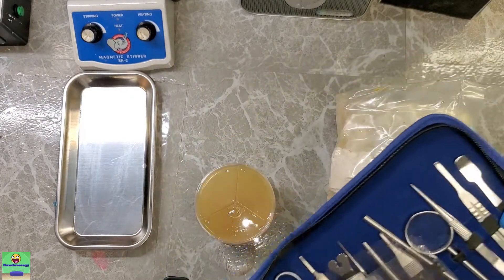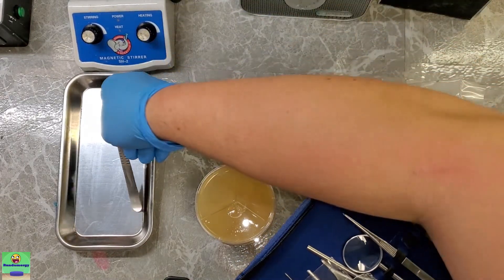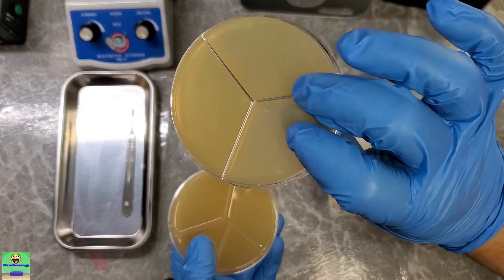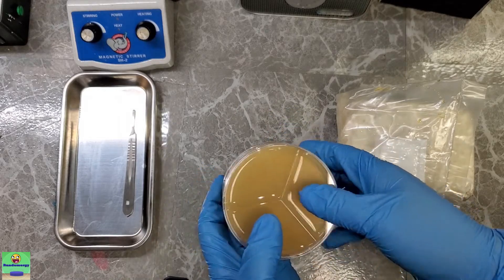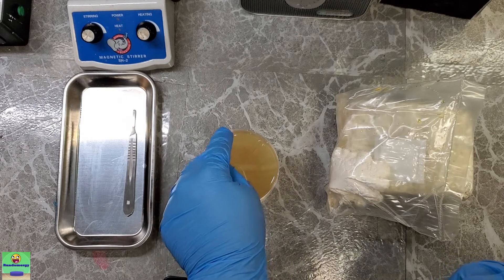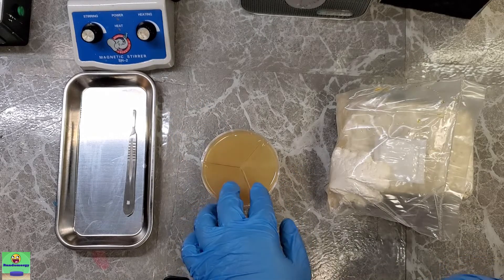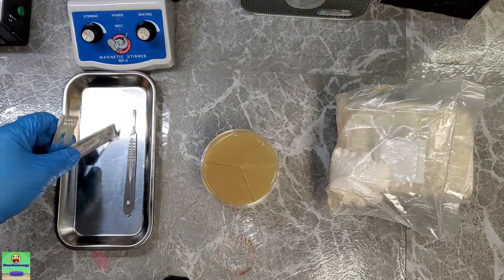Now these are the same exact petri dishes I made in my last video, and as you can see they all look pretty good — it's been roughly two weeks since I made these dishes. There were two in that batch that did form a contamination, but the nice thing about these compartmented petri dishes is if you just have a contamination in one compartment and the other two are clean, you can usually salvage that dish and use at least two of the compartments.